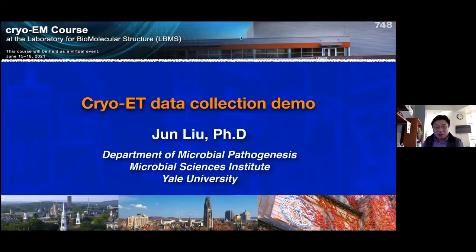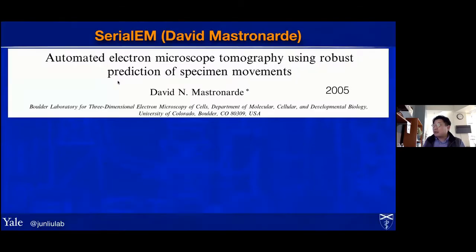Now we know how striking you have to continue to collect data to generate massive information. In a way, let's get back to this. What I'm trying to do is give you some real hands-on experience, for a lot of people who may not have a chance to operate high-end instruments like the Titan or Glacios. So maybe this is the time you can see it.